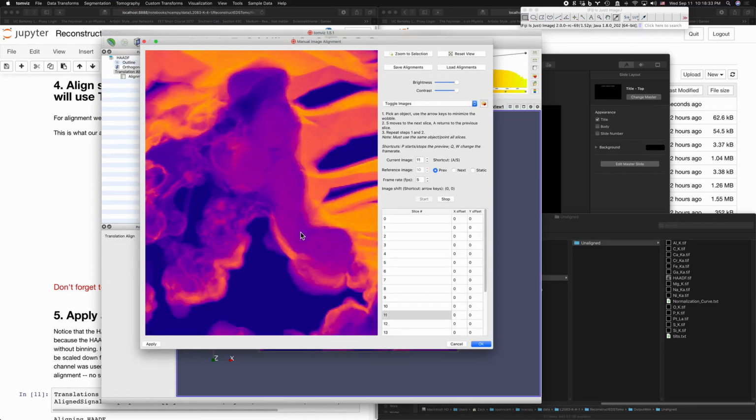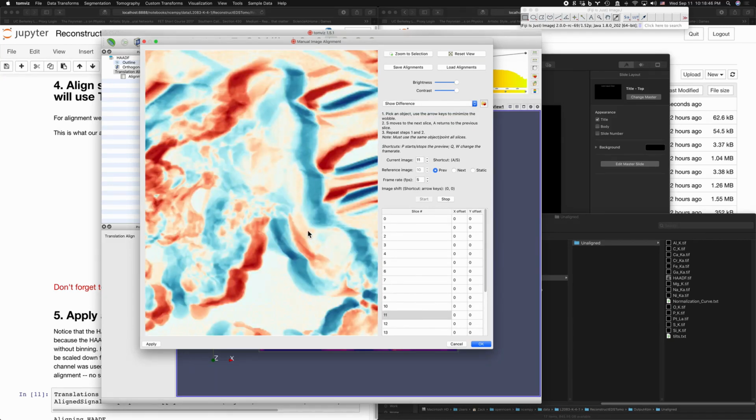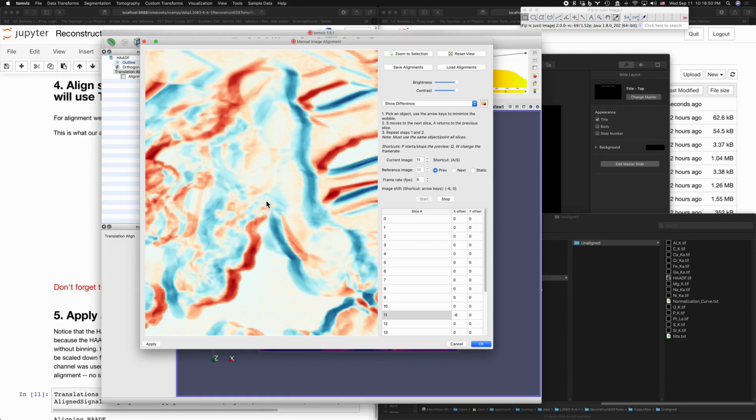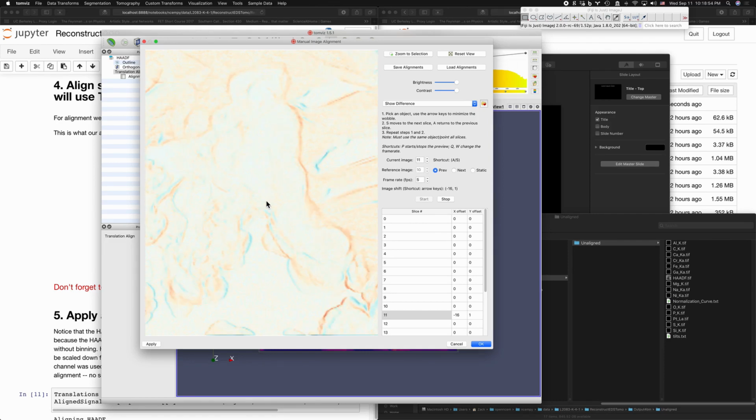We can do alignment right away. So there's a couple of ways to do it. One is back and forth between the images. So here we're comparing image 11 and 10, or I prefer to do it this way, where you click here and you use the arrow key. So left arrow, left arrow, left arrow, etc. And you just move the images until they're in alignment like this. So right there's about the best. And then you hit S.